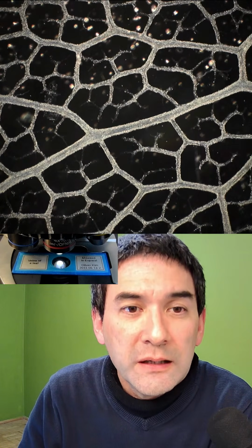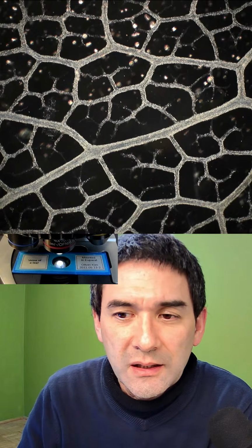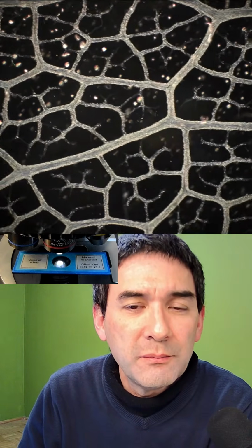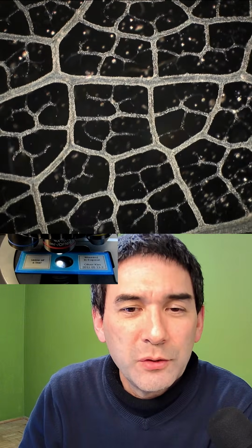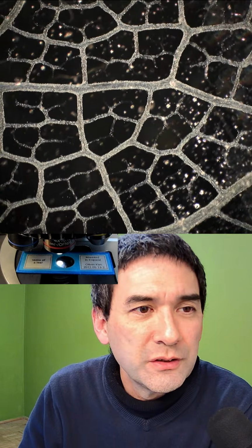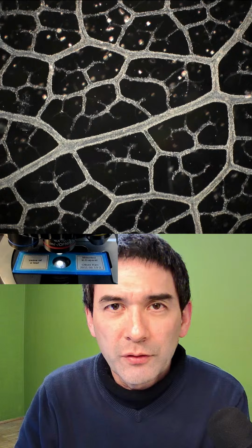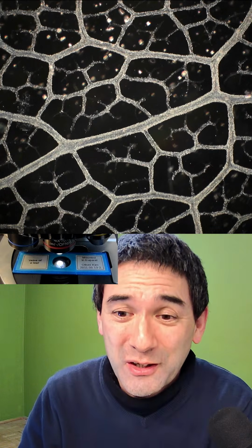Yeah, I had to boil the leaf, and then I had to strip off all of the loose cells. And for this reason, this is also one of my favorite ones, because it kind of shows a little bit the beautiful patterns of nature. And it's also a paper covered slide. I did some experimentation with paper covering slides, because the antique microscope slides sometimes are also covered with paper.